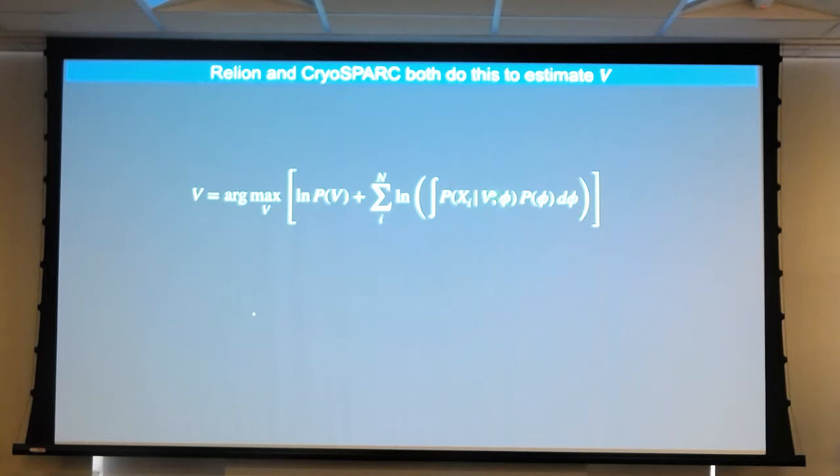We take a phi, and then make a projection, and then for every pixel of x of i, we do this comparison and exponentiation. Then we have to do this for every possible projection direction, add that all up, do that for each image. Then I'm going to vary the density in one voxel of my map, and so identify the values of a million voxels from all of my data, doing many, many of these horrible computations. So this looks like an impossible problem.